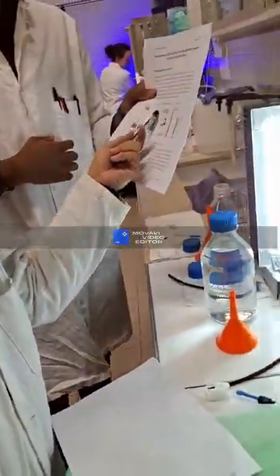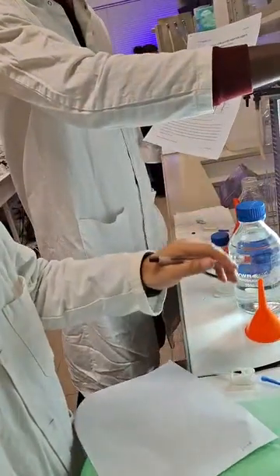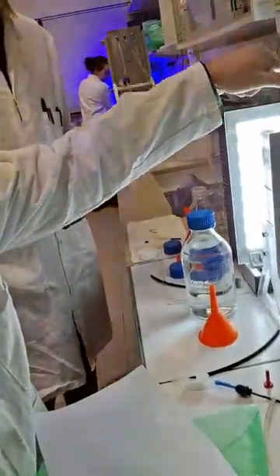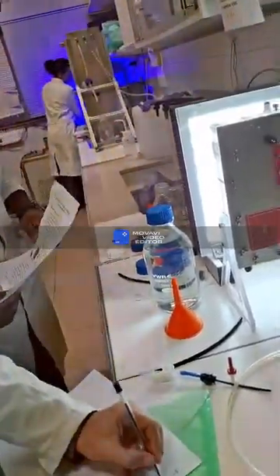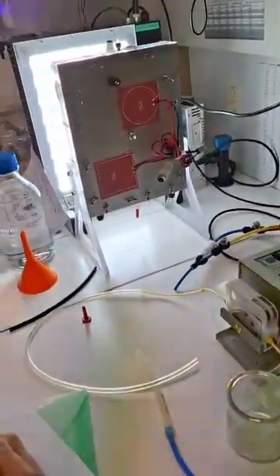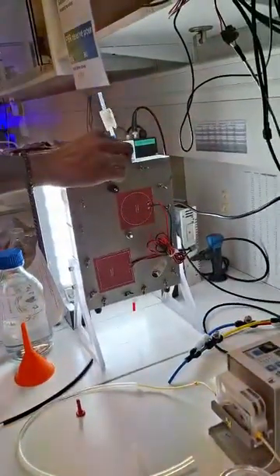What is this one for? Yes, for the dosing pump. Here, the peristaltic pump. This is the nutrient pump, and the other will be gas outlet. You can use this one, or another one. Here, it's for the collection, the sampling.